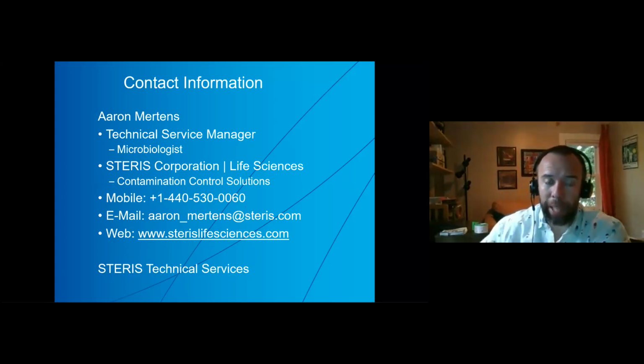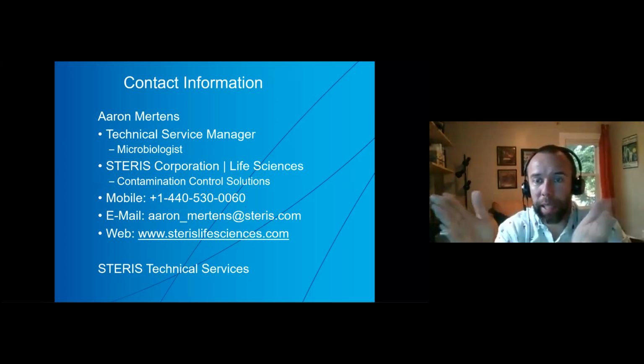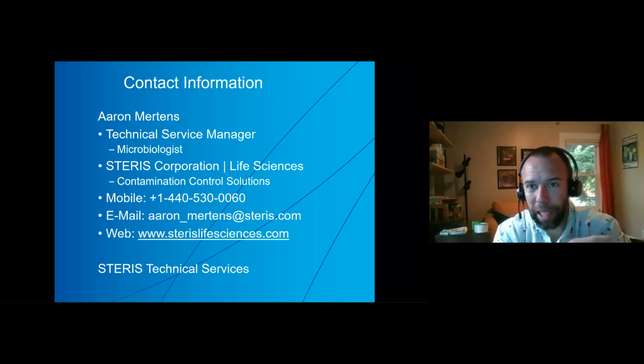So you can imagine if it's saturated steam at 121 degrees, in the presence of condensation, that temperature will drop abruptly to 100 degrees, the boiling point of condensation. So typically these abrupt drops are due to condensation.